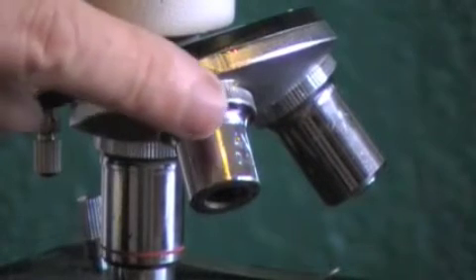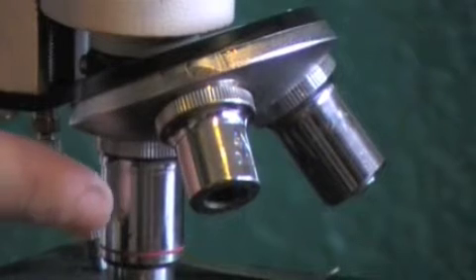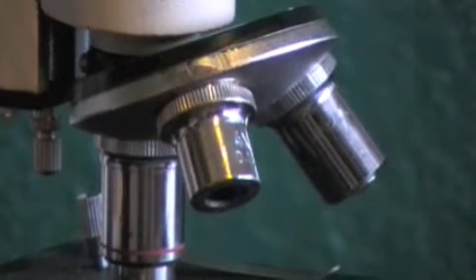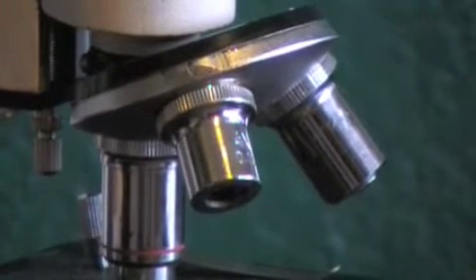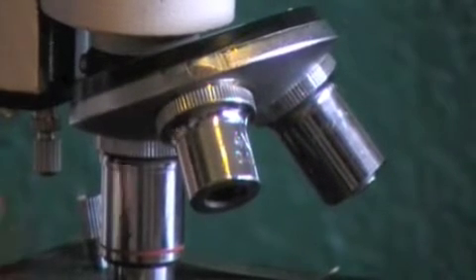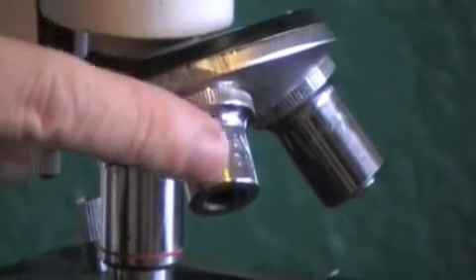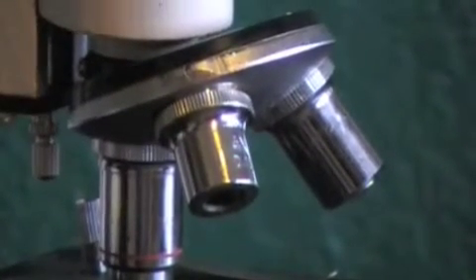Start out focusing with a scanning lens, then move to the low power lens, and then finally to the high power lens, so that when you put your high power lens there, it should almost be in focus. Now, we've covered the stage clips, we've covered the stage, we've covered focusing, we've covered your nose piece with your objective lenses, and your ocular lens.